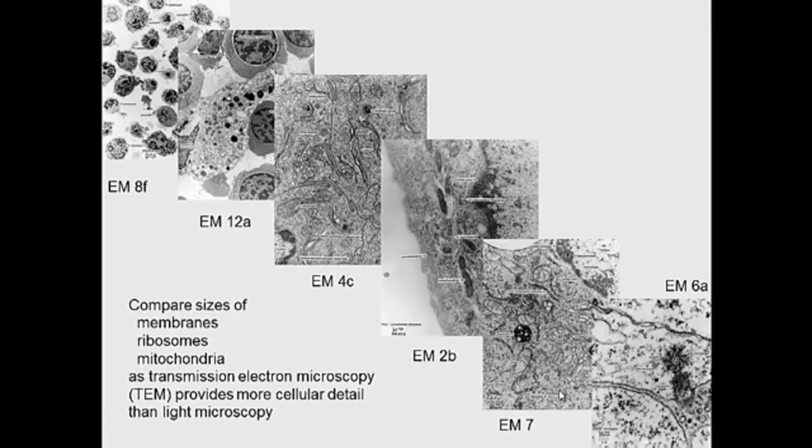And the electron microscope has different images that you can see, and what you want to be is a little bit mindful of the magnification that you have there. When you think about magnification at a light microscopic level, think about a red blood cell. You can always see a red blood cell in a tissue somewhere, and it should be about 7 micrometers.